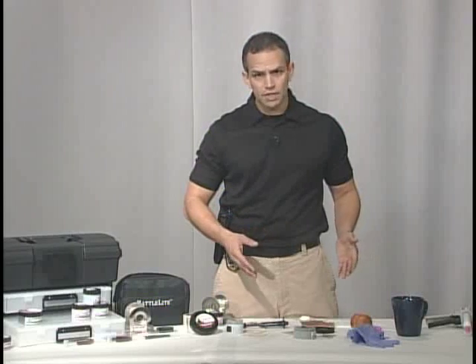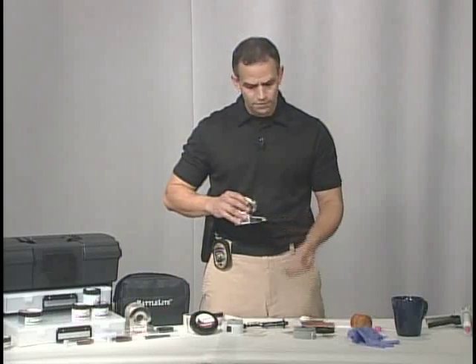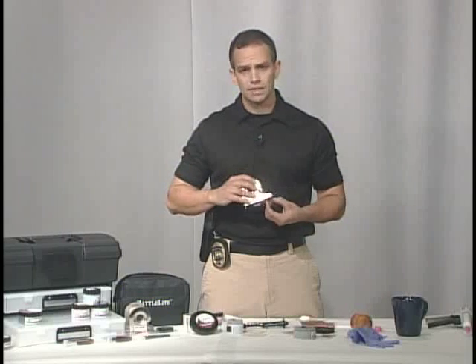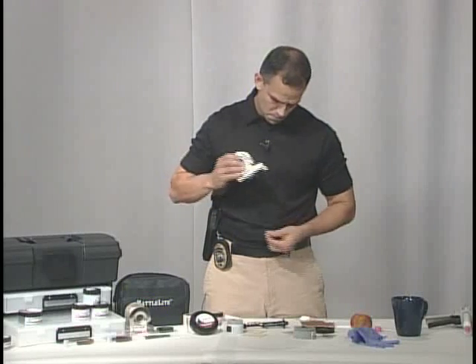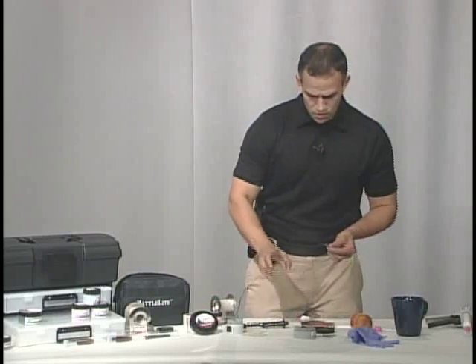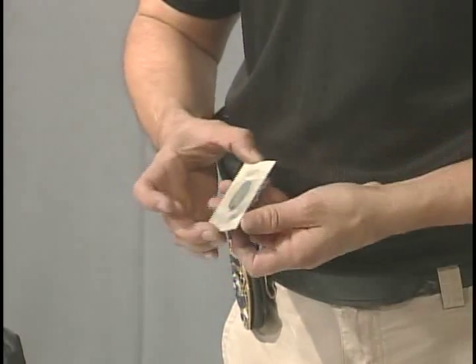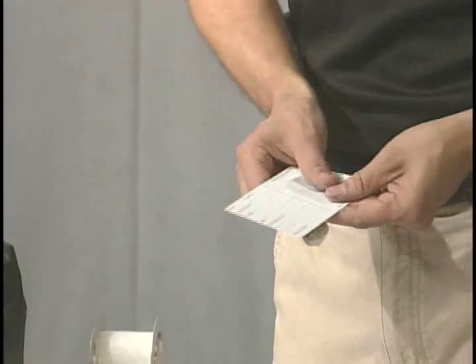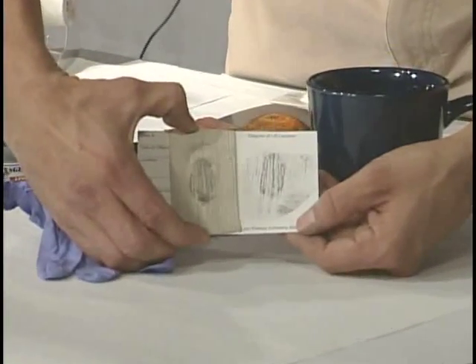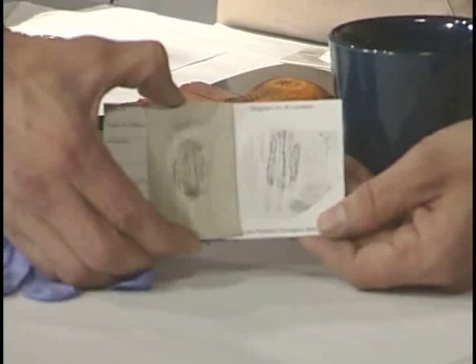Now that we've developed our prints on different objects, we're going to use different techniques to lift them. If you use a flat regular tape to try to lift a print off a textured surface, you're going to miss a lot of that ridge detail — I'll show you what I mean. This is our regular tape. We have our print here on the siding. I'm going to lift it and place it on the backing. Now what you'll see is we left a lot of our fingerprint on the vinyl siding because it didn't get down into the grooves of the siding. So we left a lot of our evidence behind.